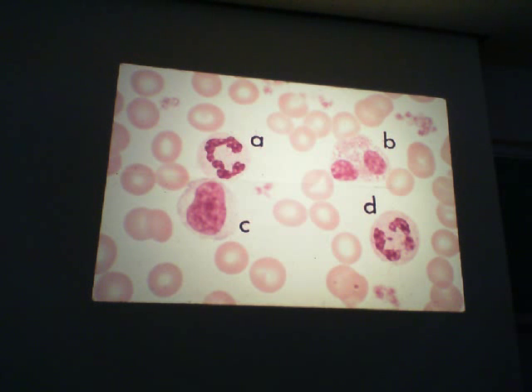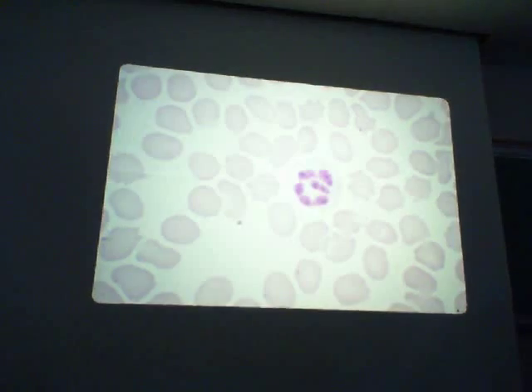The eosinophil is going to kind of mimic that a little bit darker, but these are still kind of dingy as compared to a really nice blood smear stain. So we've got kind of dingy red blood cells. So that'll make the eosinophil granules a little bit dingy as well. That cell, that is probably a monocyte. I would not put anything that would be argumentative on the lab practical.